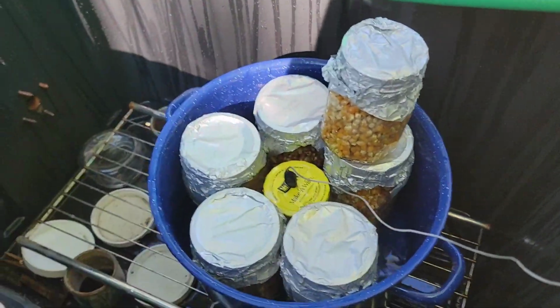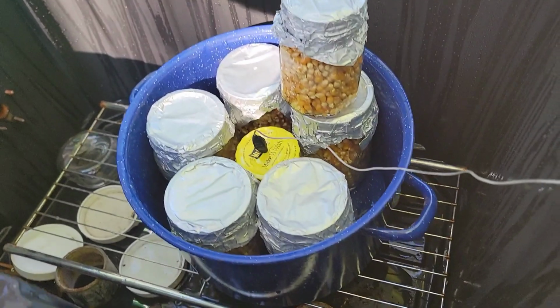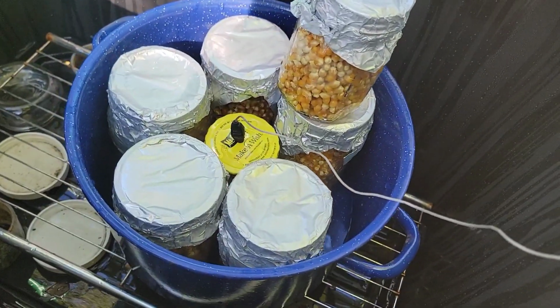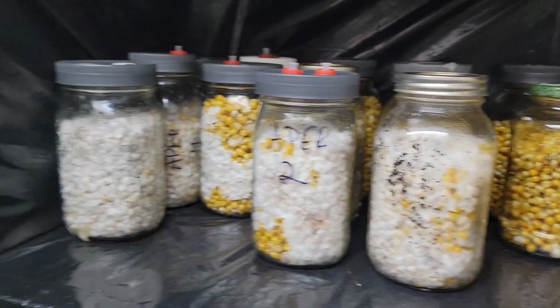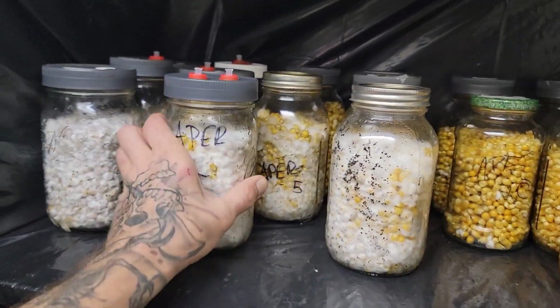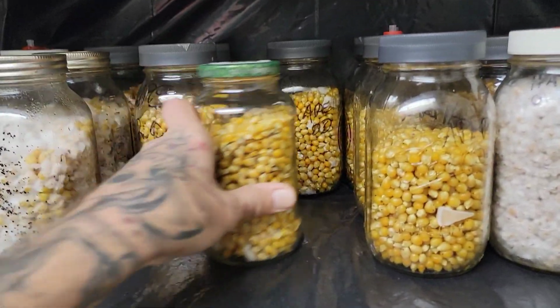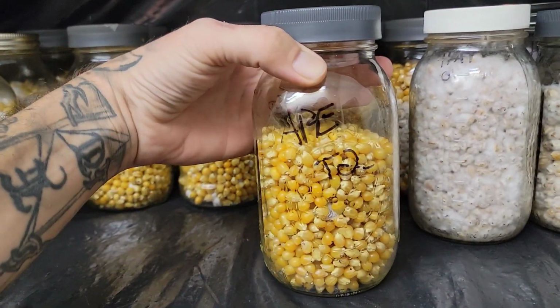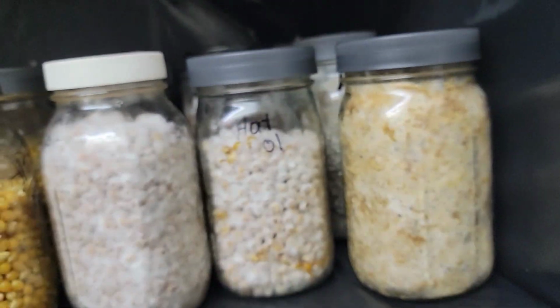And what does this look like when it's colonized, you may ask? Because, oh, we didn't hit pressure or temperature. It won't colonize. Well, then why do I have all of these? As you see, popcorn is my main grain. They have all been through steam sterilizer. And no issues whatsoever. Sclerotia.